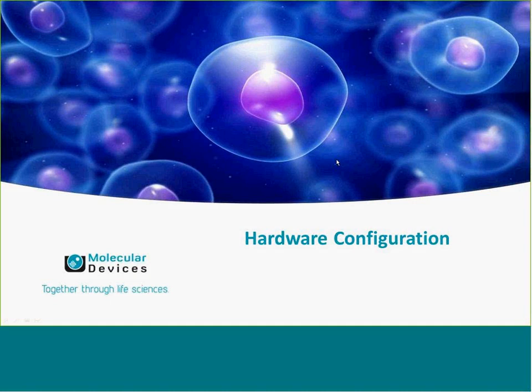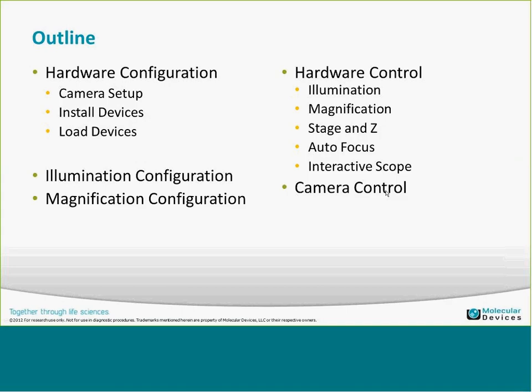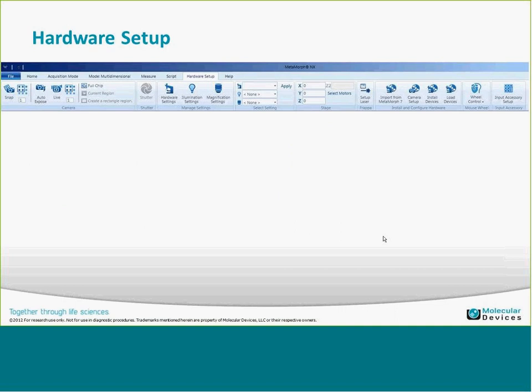Now we're looking at hardware configuration. We'll go through how to set up a camera, installing devices, loading devices, the illumination configuration, magnification configuration, and the hardware controls for the different components and camera controls.